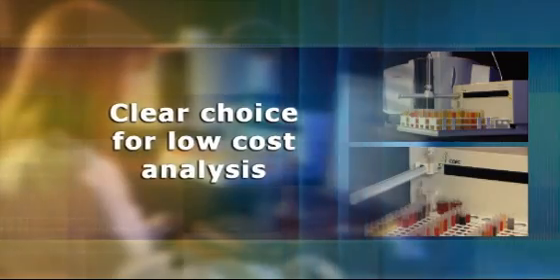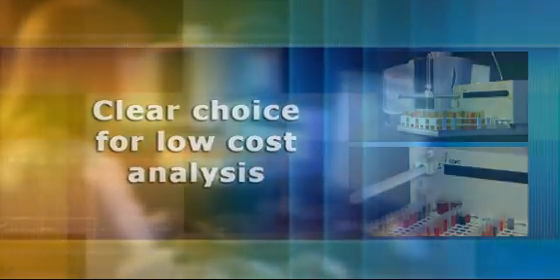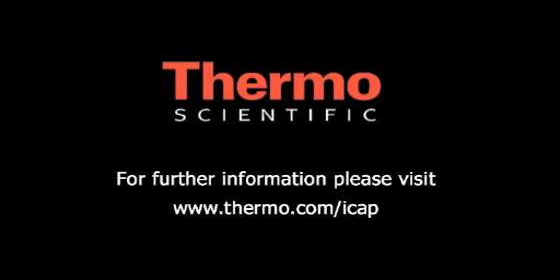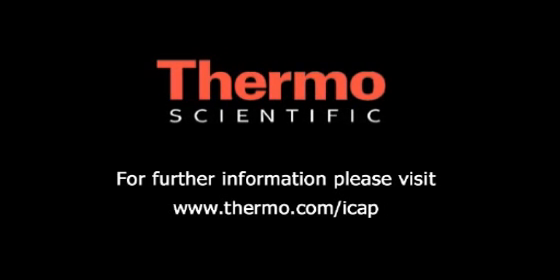making the iCAP 6000 series the clear choice for low cost analysis. For more information on the iCAP 6000 series, visit www.thermo.com/ICAP or call your local sales office.